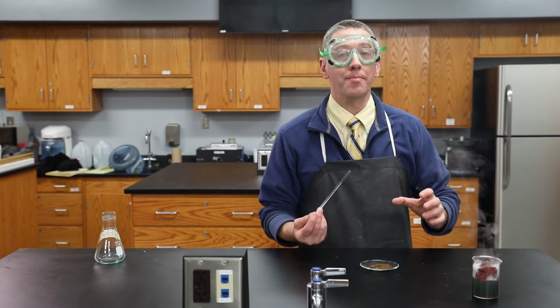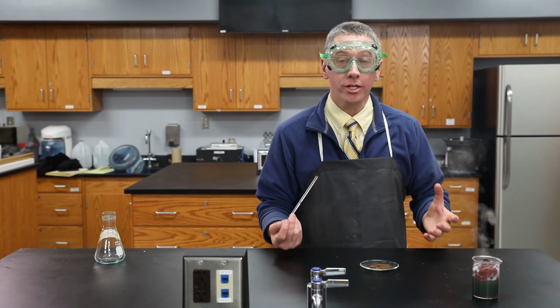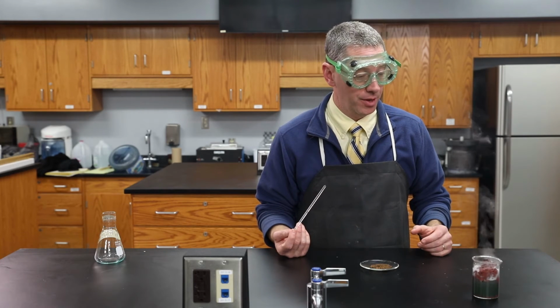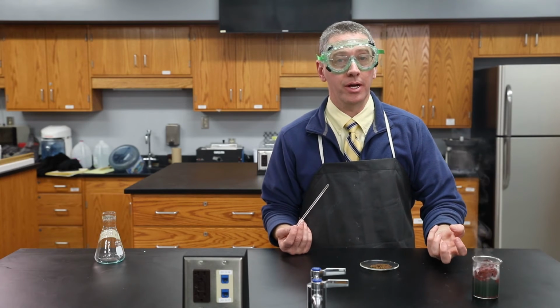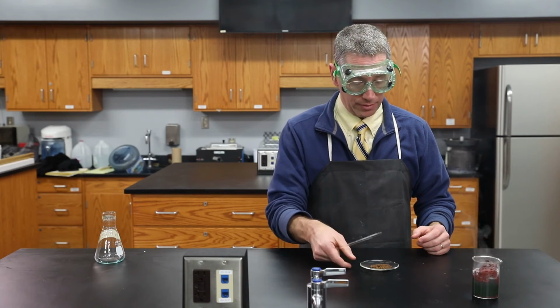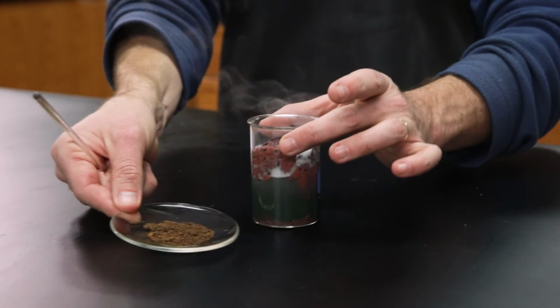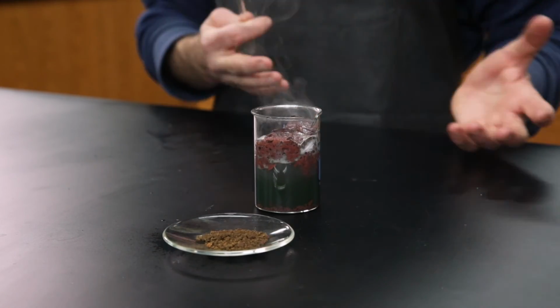Now, as long as you know the mass of the aluminum and the mass of the copper chloride before you start, then you can calculate how much copper you should get during this reaction. When the reaction is complete, the metallic copper will be at the bottom of the beaker. You can pour the liquid off the top, wash it with distilled water a couple of times, and allow it to dry. And that will create a final product of pure copper metal that you can get its mass and compare to the theoretical amount.